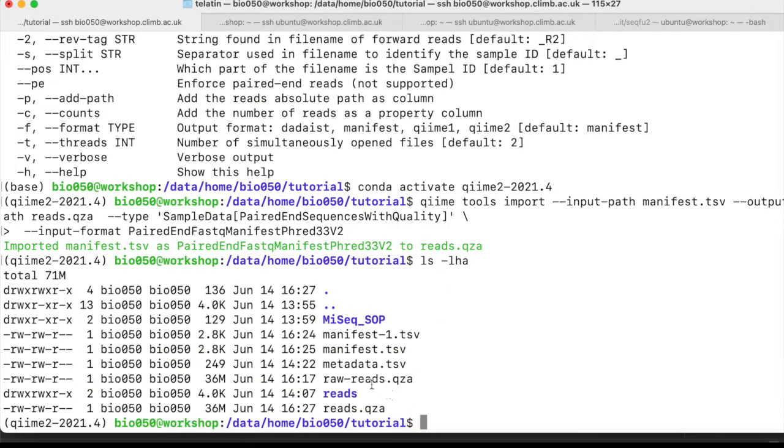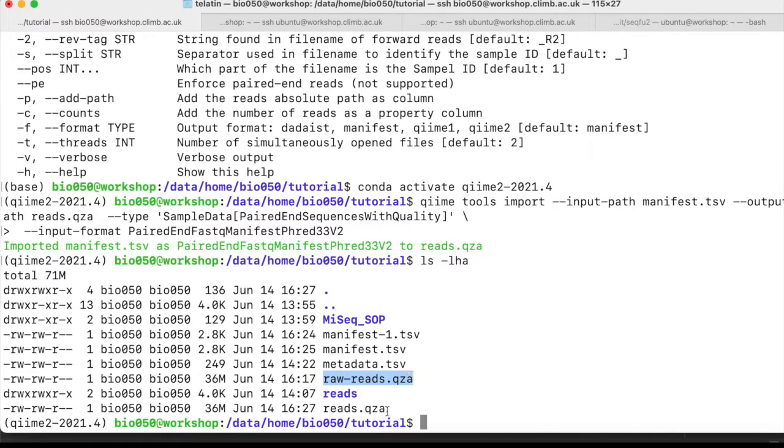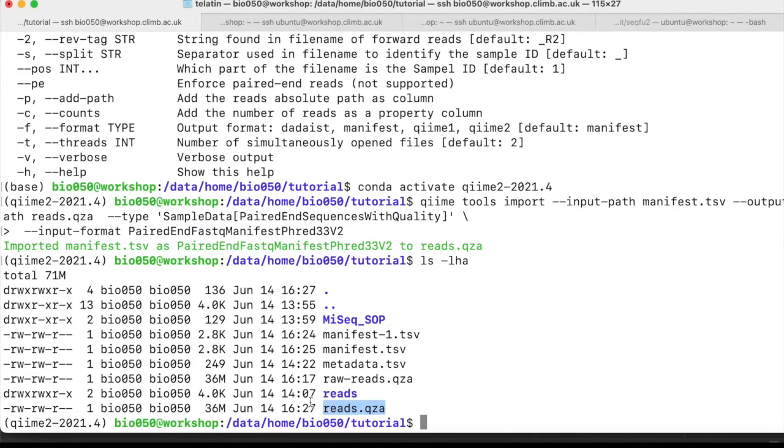And we have now two artifacts. One was created exploiting the file names coming out from the Illumina machine, and the other using a manifest file, a more general approach. And with this artifact, we are ready to start our QIIME2 workshop finally.